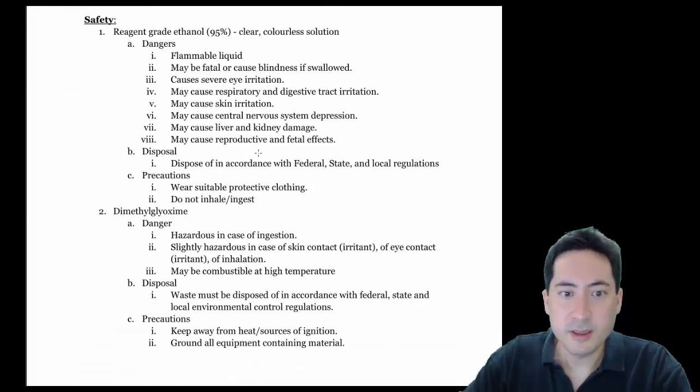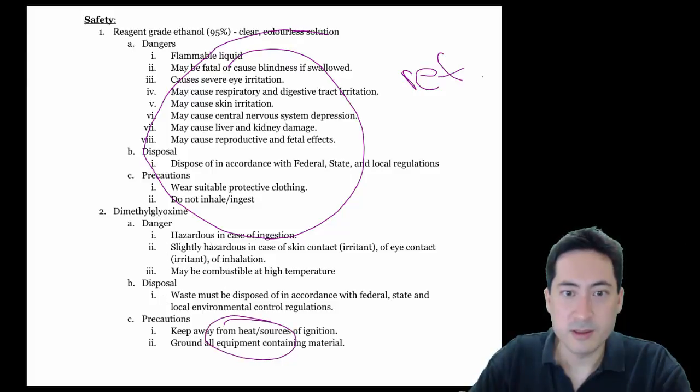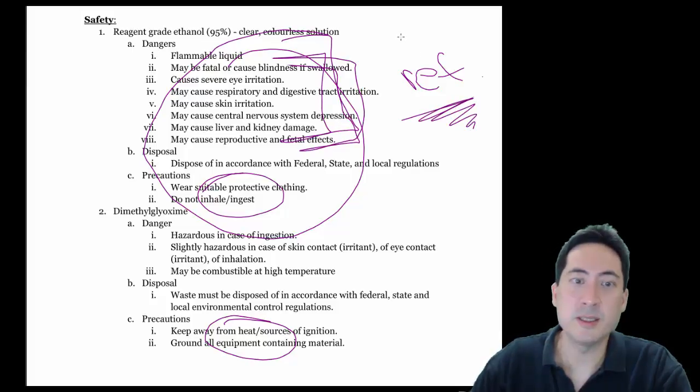Going to safety here. This looks like a cut and paste. It also doesn't have a reference, and it doesn't actually tell me what to do. Here it is. That's what I care about. Just give me an idea of what the real dangers are. Make it a little bit better than just cutting and pasting, and tell me where you got it from, hopefully from CLEAPSS.